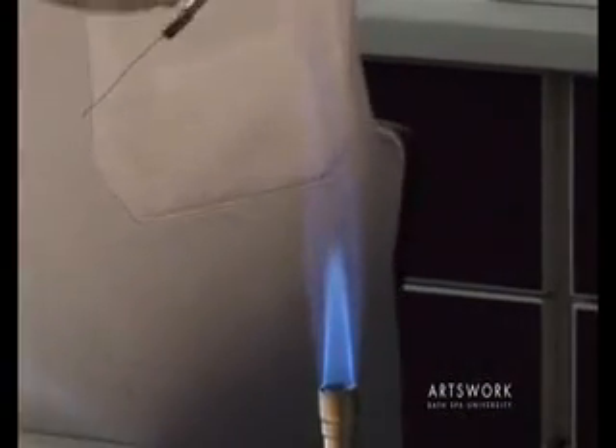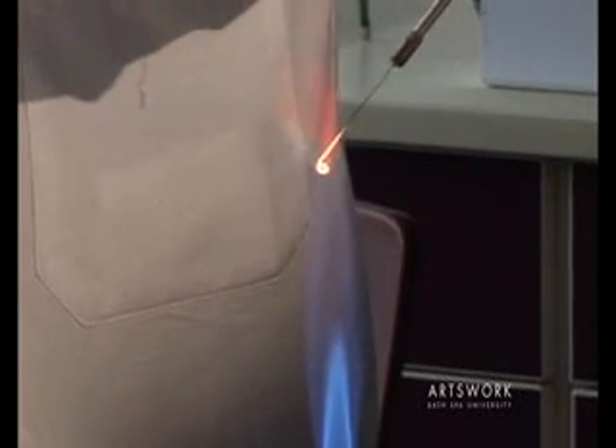Alternatively, if you have it too high, the flame is cooler, so it's not as effective at sterilising that loop.